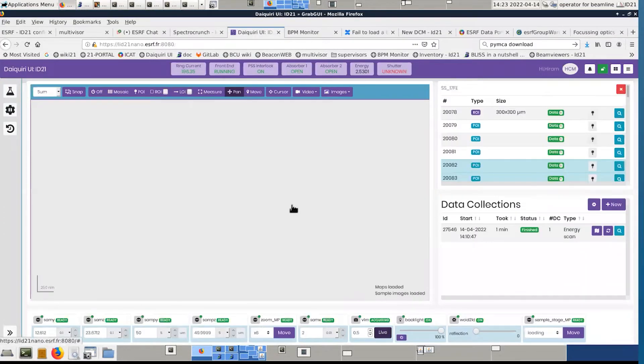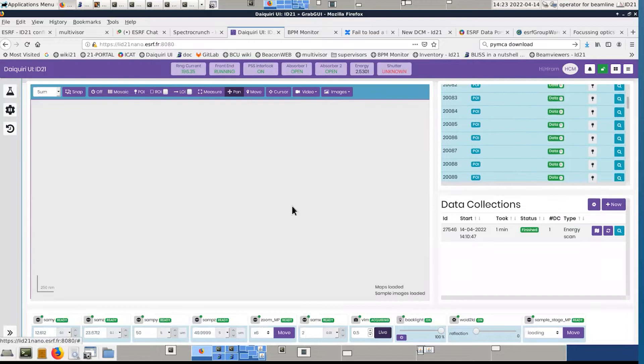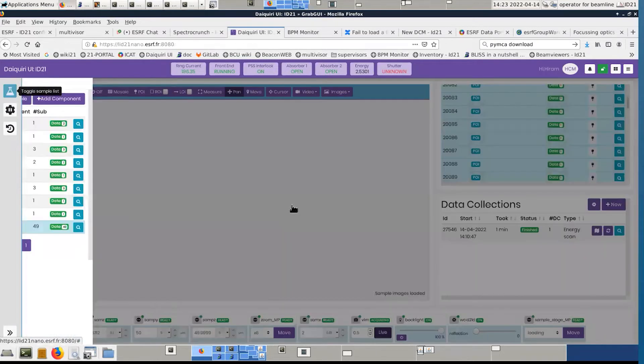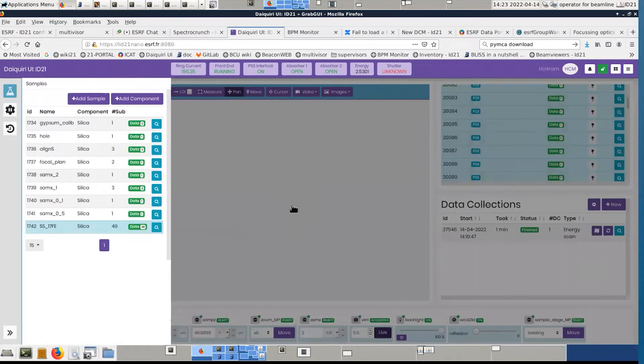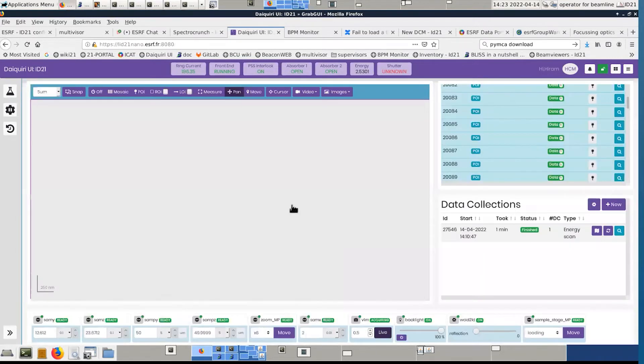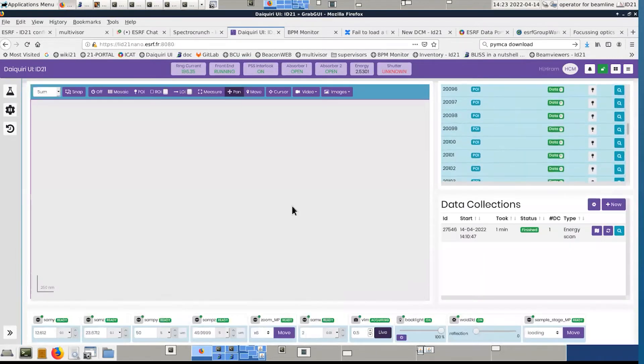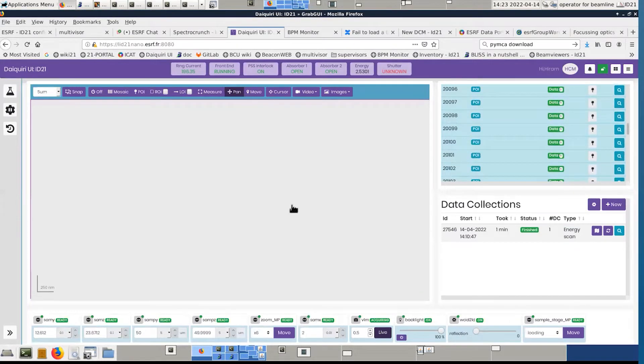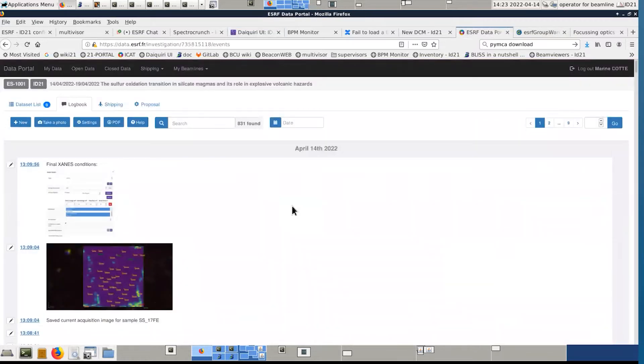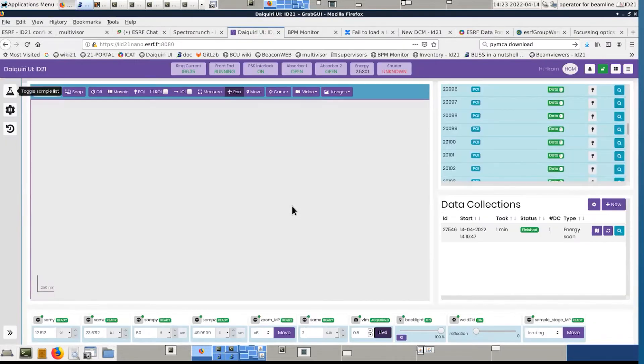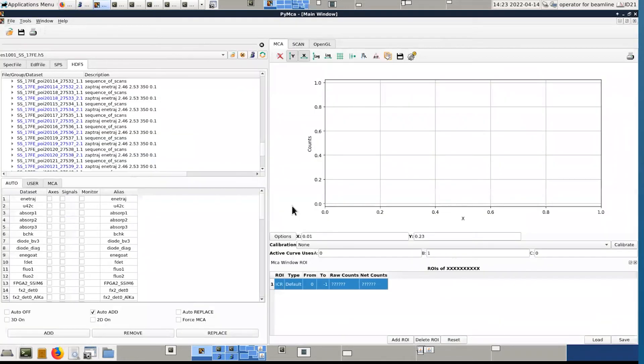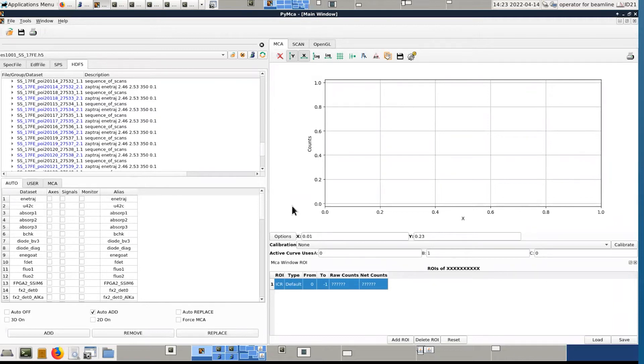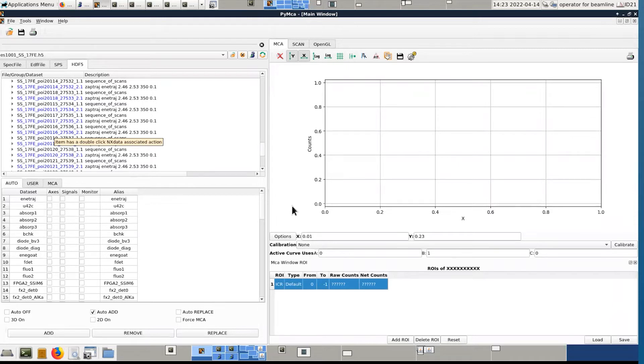What you see is that the name of the points are different because they correspond to each of the points which have been defined in the graphical interface, and they are unique. But they are not sorted following the number there. They are sorted following the chronological order where they were acquired. That's not critical because what is important for you to know is what is the point number.